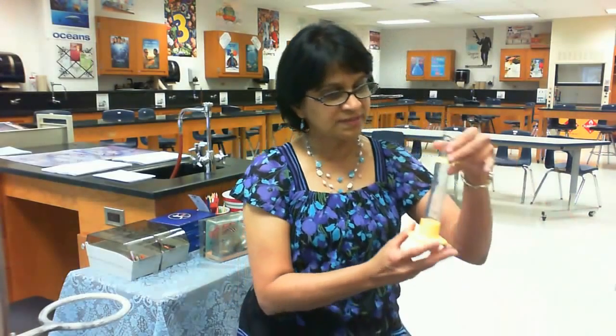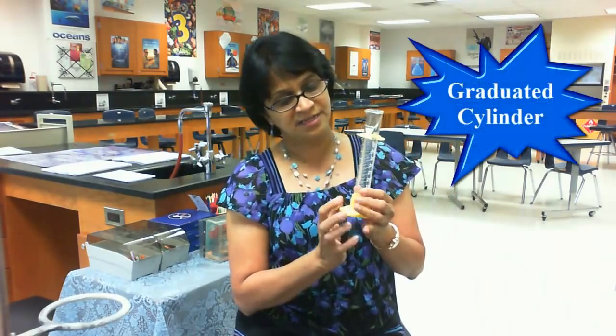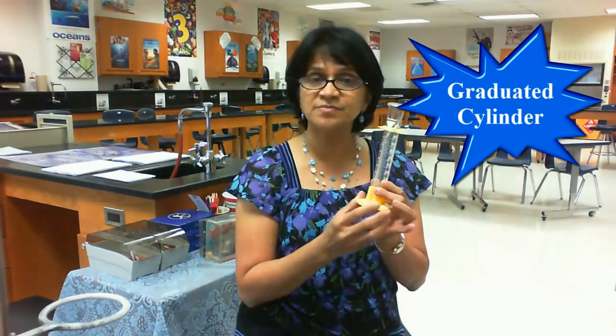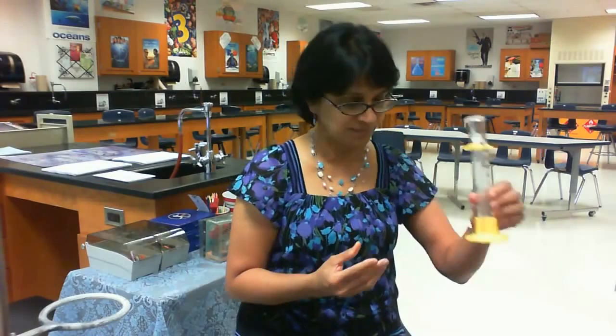Coming to the third equipment, which is a graduated cylinder. It has all fine markings, and then we can get a precise measurement of how much liquid we are going to add for a reaction.